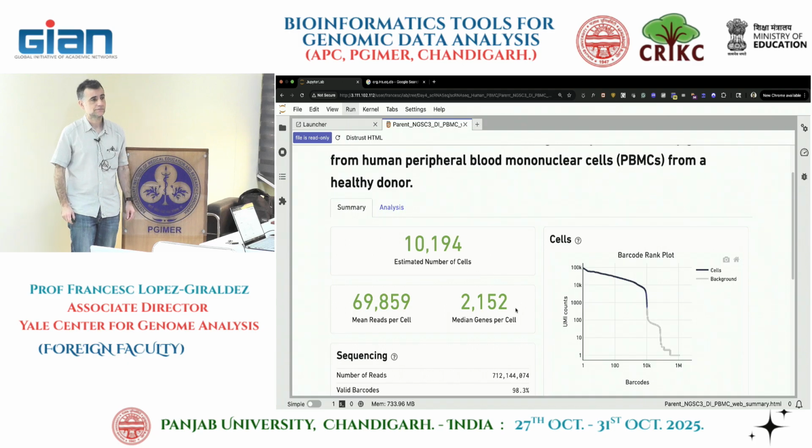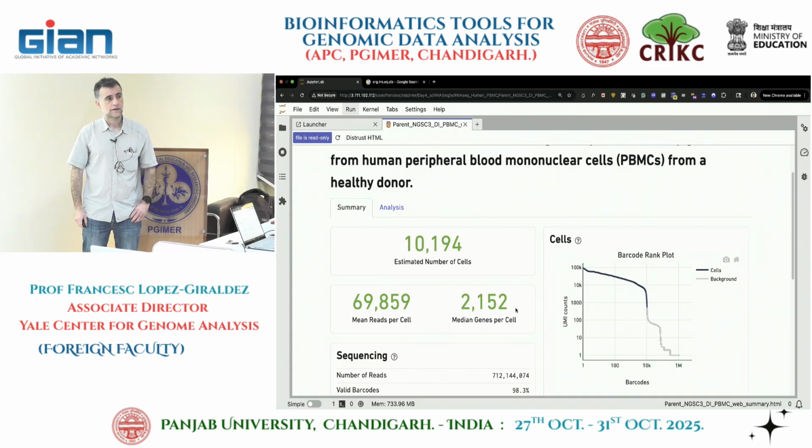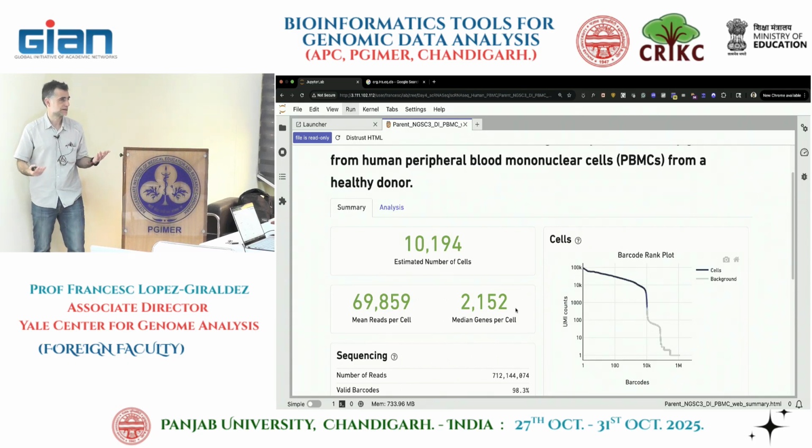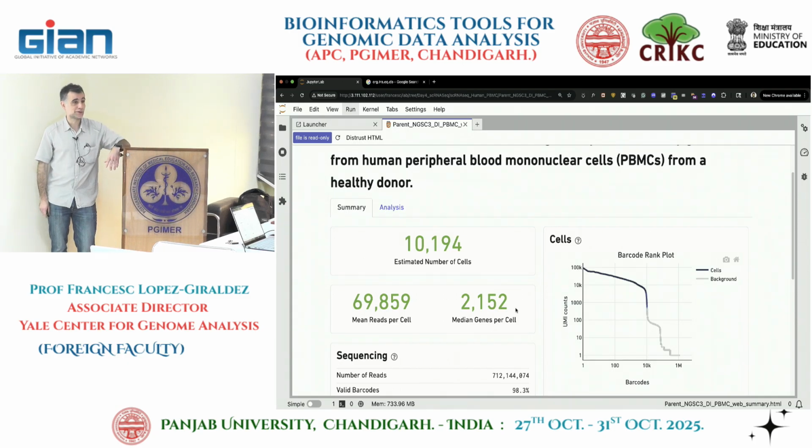Is there any mean that this much it should be like that? Any number? Yeah, 20,000. That's what they recommend. You can use that. I mean, if you get 19,000, you're going to throw away your data? Probably not, right? But that's a recommended, above 20,000. I've done analysis even for less, but again, it depends. Are you exploring? Is it your first analysis? Is it maybe worth it not to throw it away, just check it, or not to add more sequencing?